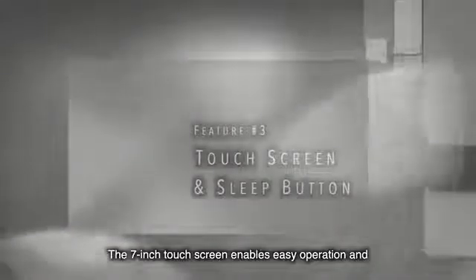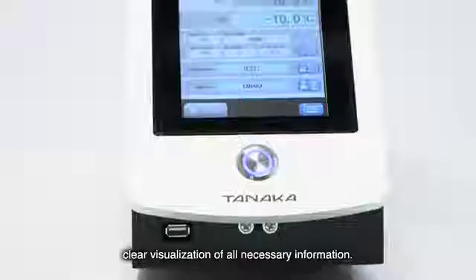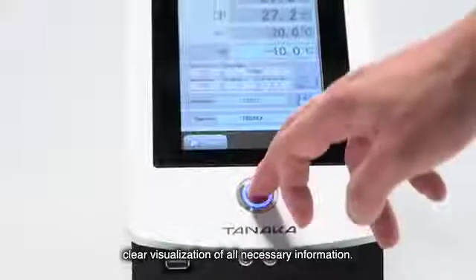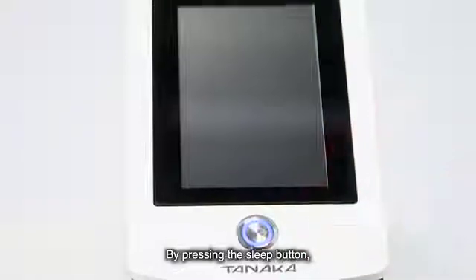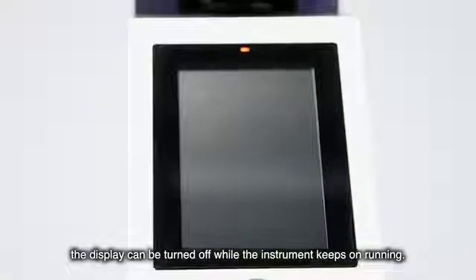The seven-inch touchscreen enables easy operation and clear visualization of all necessary information. By pressing the sleep button, the display can be turned off while the instrument keeps on running.